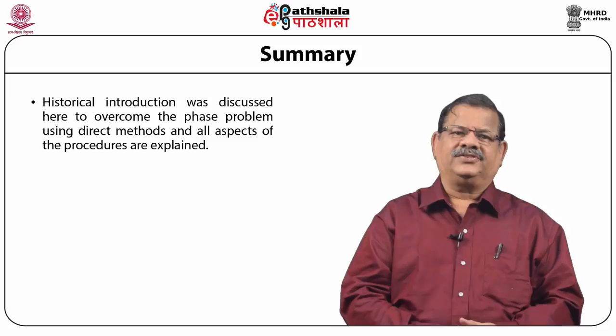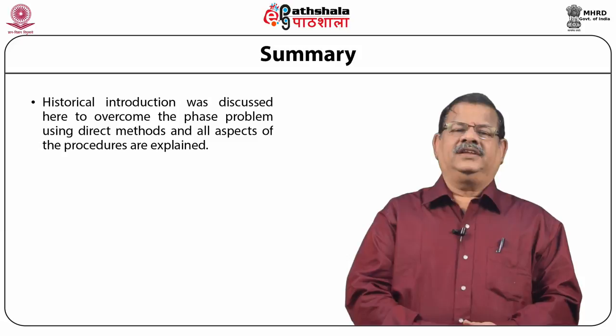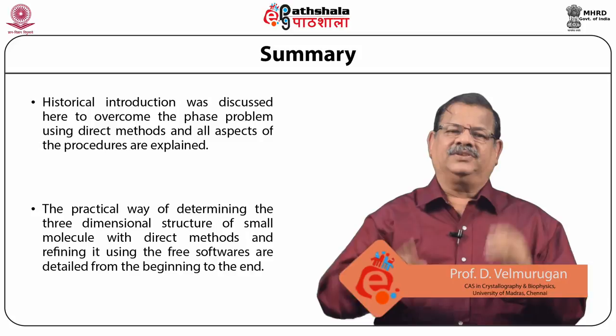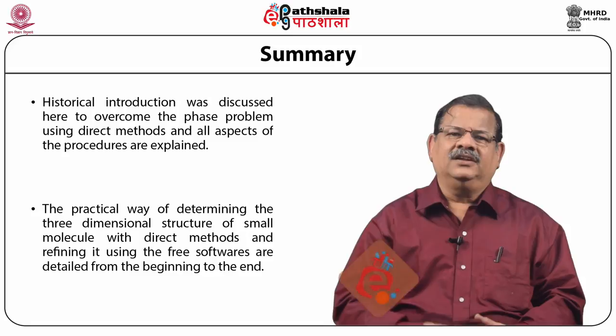And of course, another reason being I did my postdoctoral training for 4 years under him. So I had the pleasure of popularizing his field of interest. The practical way of determining the three-dimensional structure of a small molecule with direct methods and refining it using the softwares are also detailed from the beginning to the end. Of course, these softwares are free only, no problem.